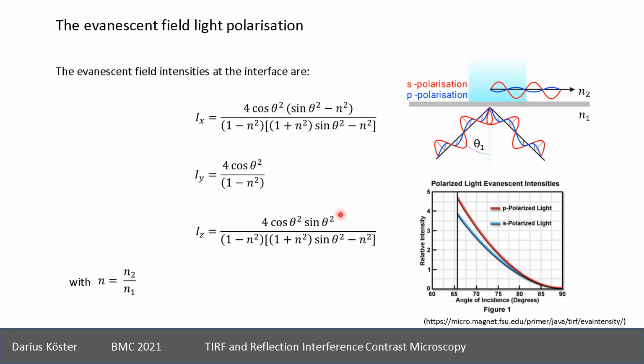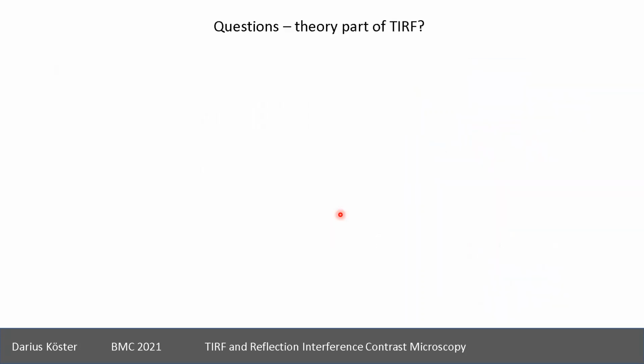So these are, I think, the key components that are important to keep in mind when doing TIRF microscopy in terms of the basics. Are there any particular questions?